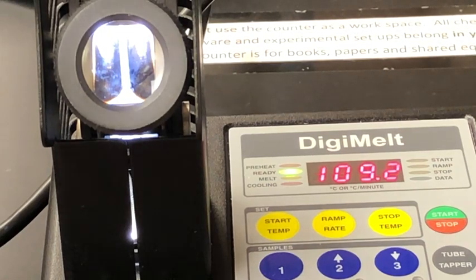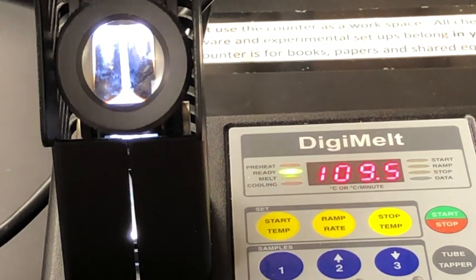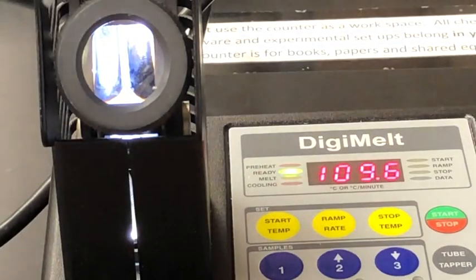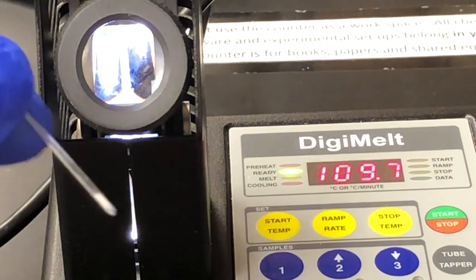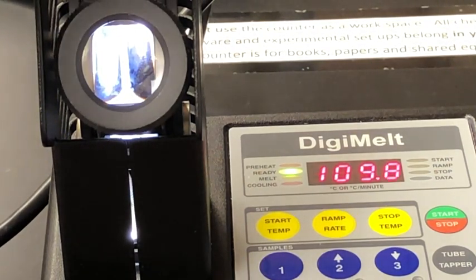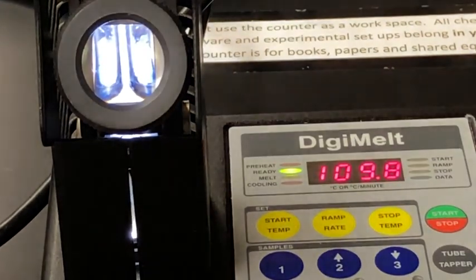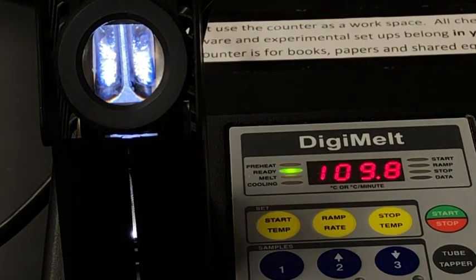Now that the Digi-Melt is ready and preheated, I'm going to add my sample of aspirin — or what I hope is aspirin — into the first slot. I also prepped a sample of what I know is pure aspirin from the stock room, and I'm going to place that in the slot to the right so that we can compare their melting points.